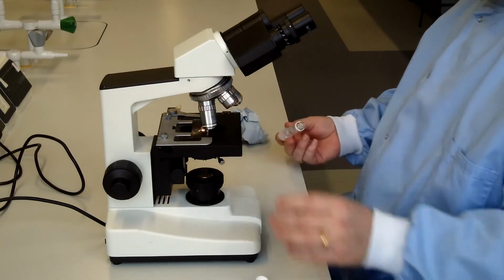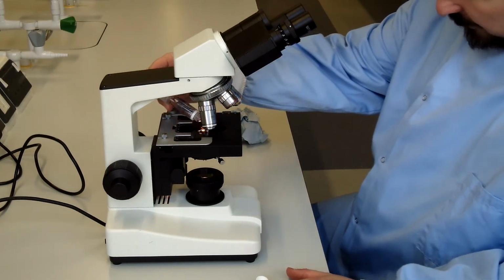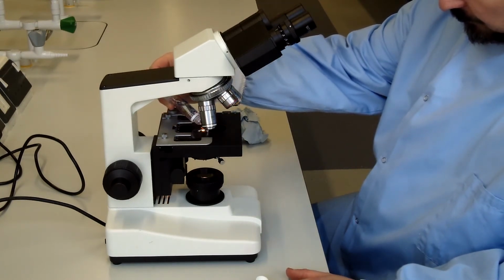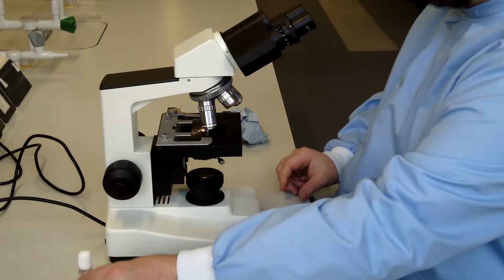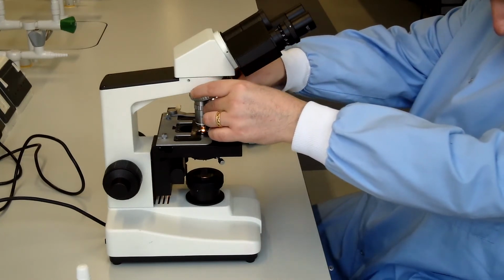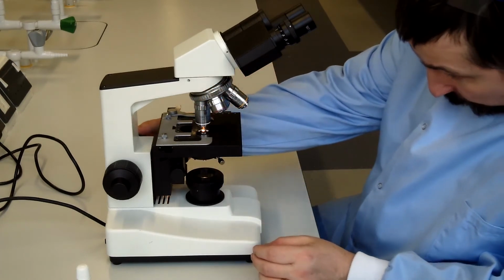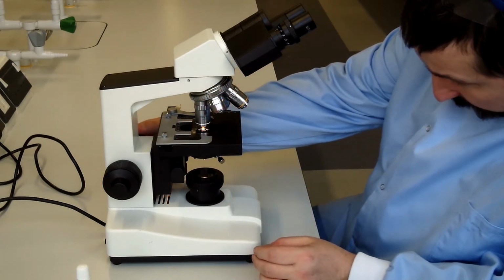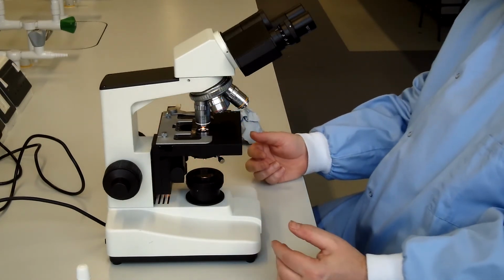So to prepare your slide, you move the objective out of the way and take the immersion oil and place a spot of it on the area of the slide that you're interested in looking at. And then we can swivel the oil immersion lens into position. This time, when we bring our eye level down to that of the stage, it's important that the oil that is on the slide comes into contact with the actual lens itself. So as we bring the stage up, that's what we're looking for, to have that contact.